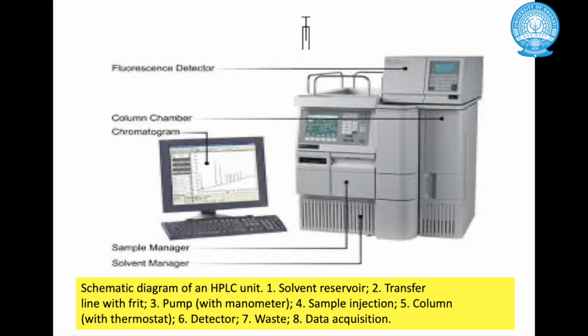Here is a simple schematic diagram of an HPLC unit where a solvent reservoir is required, a transfer line with frit is required, and a pump with manometer is required.